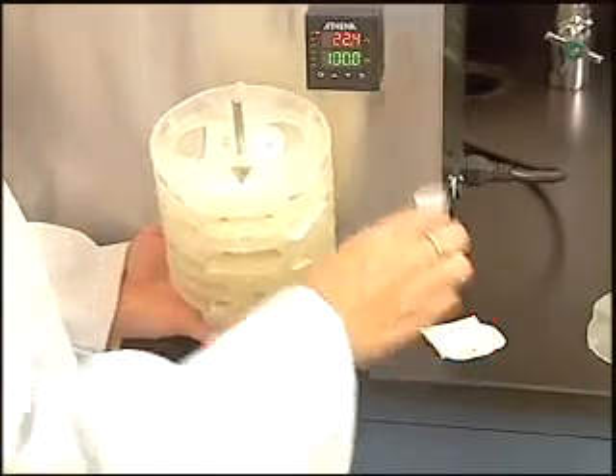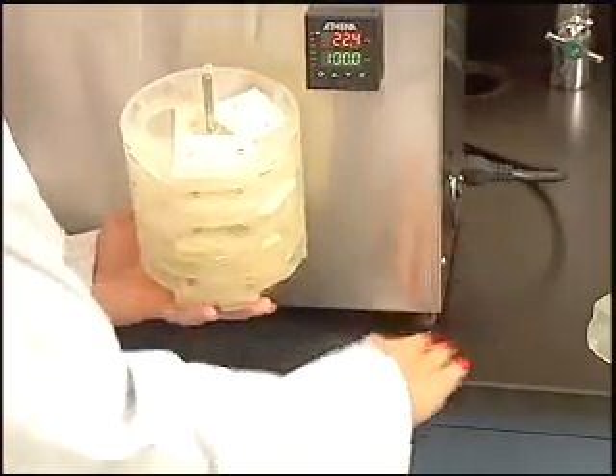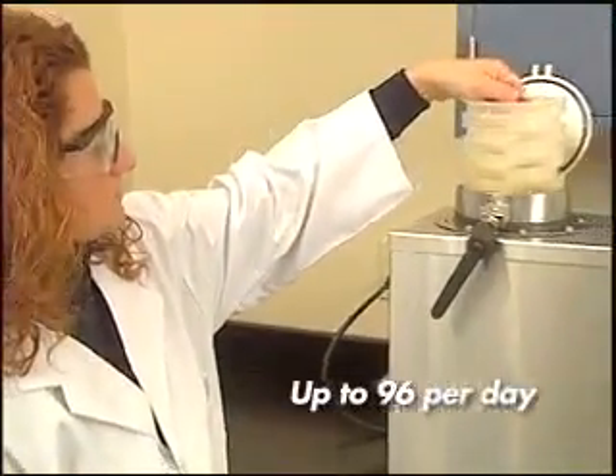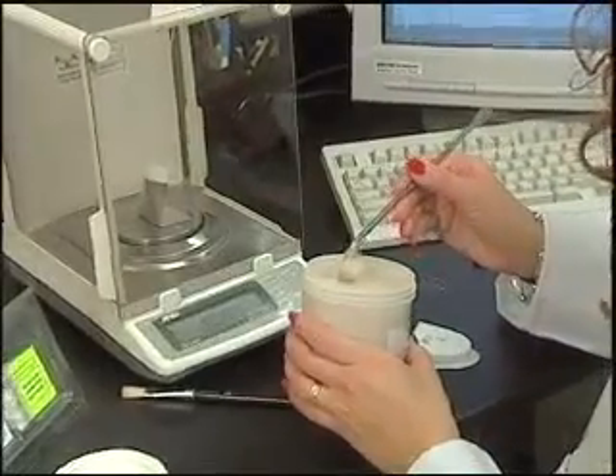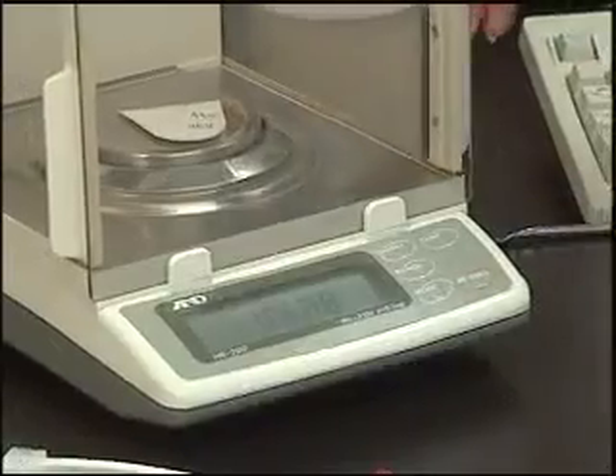With the ANCOM fiber analyzer, one technician can complete up to 96 fiber determinations during the normal workday and still complete other work. When the process is complete, the samples are dried and re-weighed to determine the fiber value.